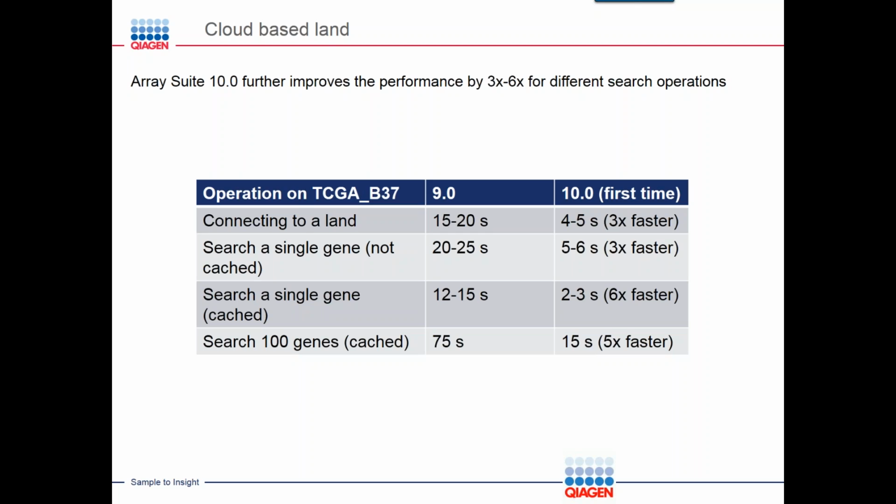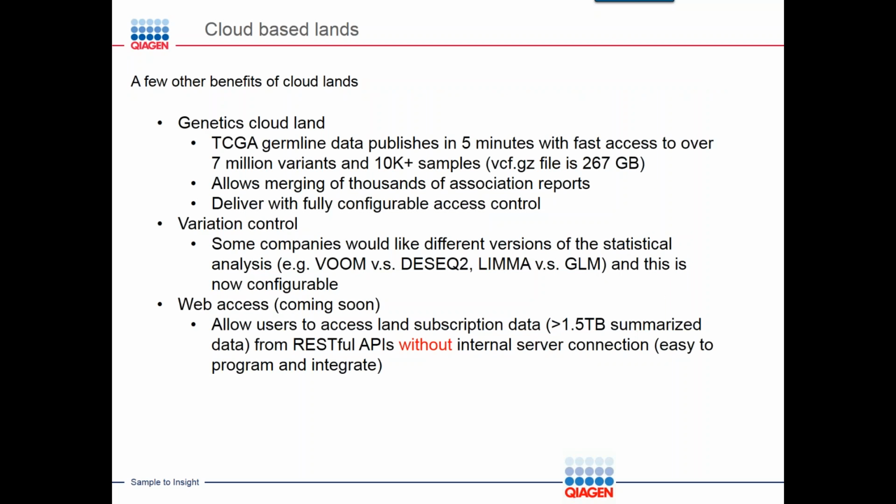In practice, this will improve the user experience. And as I will mention in the next slide, if this kind of search happens from the API, from the programming side, this will make an even bigger impact.